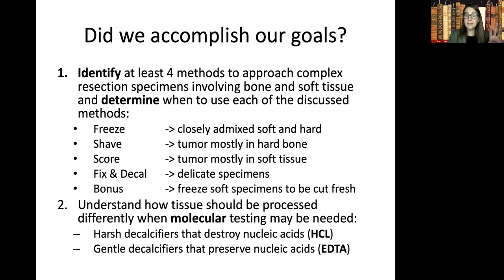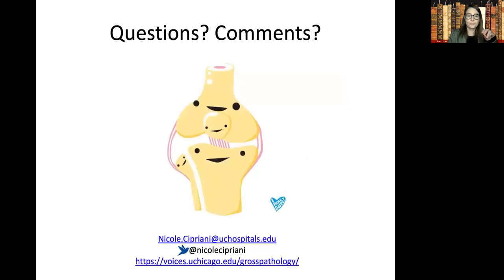We talked about molecular testing and how you should proceed if molecular testing may be desired, as in your harsh decalcifier HCl will destroy nucleic acids, but your gentle chelating agent preserves them. We recommend EDTA. So I'm happy to open the floor for discussion.